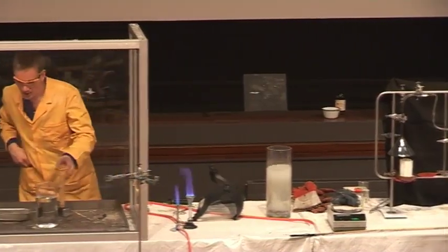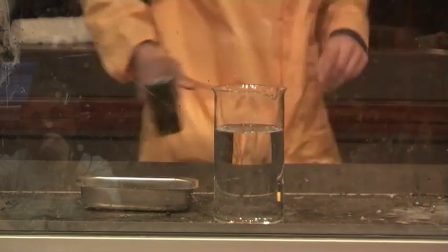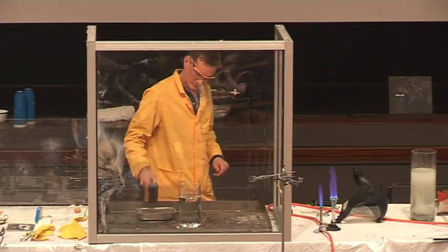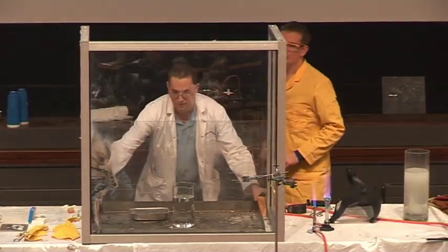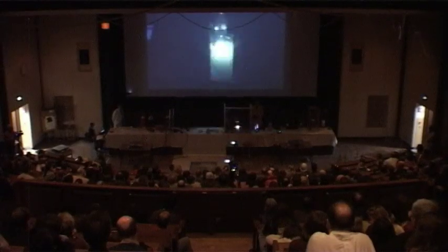And we should be able to show this. I'm going to take the test tube that we've just heated up and smash it up. Okay, and then tip this into some acid. Yep, thank you. And we should be able to see some of the crackling that we had before. So if we just have the lights down, please. Okay, again, this is forming silane gas, SiH4, and as soon as it comes into contact with air, it spontaneously catches fire, as we see there.